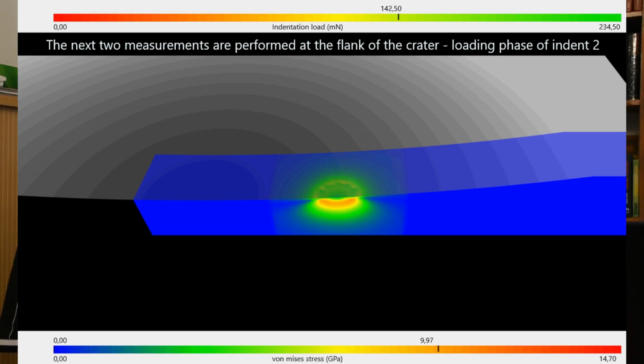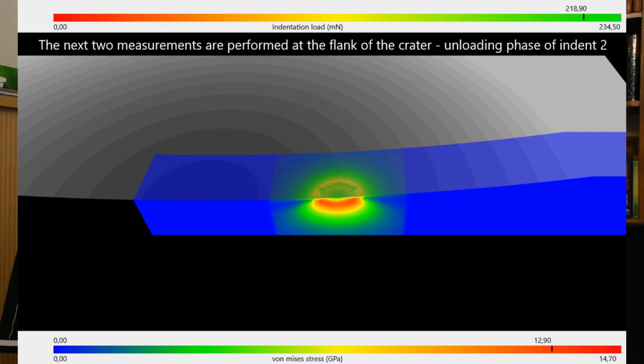Okay, so last time in the Calotte video, we did an indent at each and every measurement point. I said you can also scratch. An indent is very simple. There's just one force that is pressing the indenter down. With a scratch, this is a little bit different.